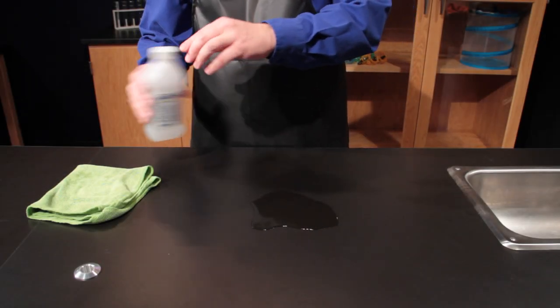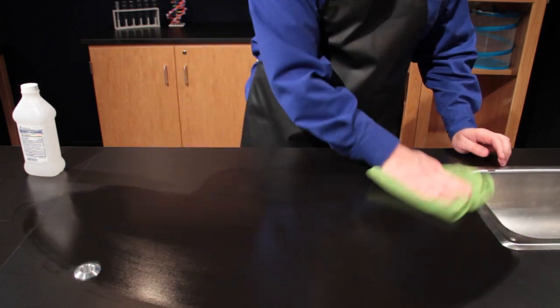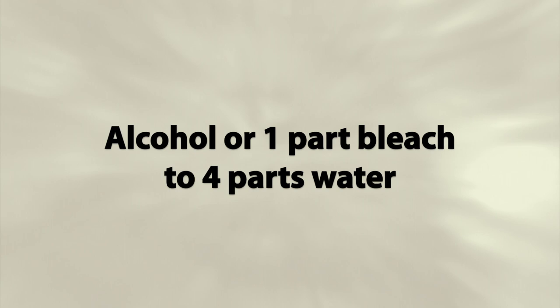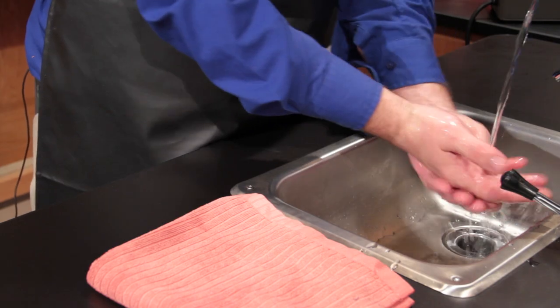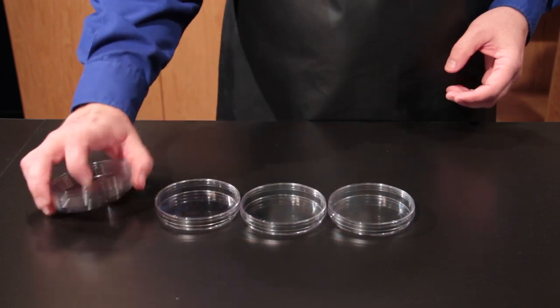While waiting for the agar to cool, prepare your work area for pouring plates. Choose an area that is free of air movements. Clean the area with alcohol or a solution of one part household bleach to four parts water. Wash and dry your hands. Once the work area has dried, put out your sterile plates.